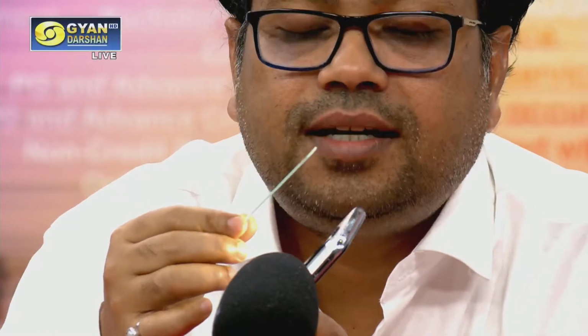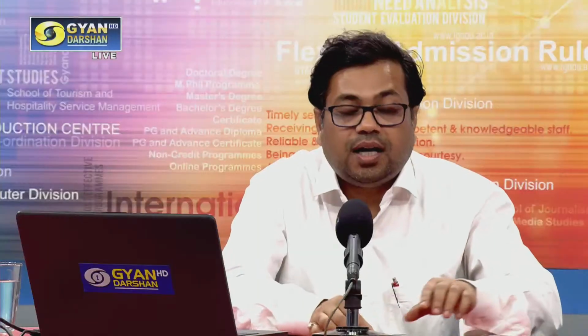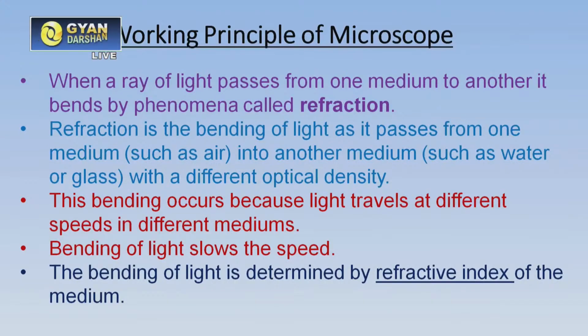When light interacts with the glass, after passing through the glass, the light is deflected. The path of the light is different. These are the properties which happen under the light microscope, and this is the process by which the image is formed in the light microscope. This bending property of light occurs when light goes from air to the glass medium and from the glass medium to water, so the direction of light is different.